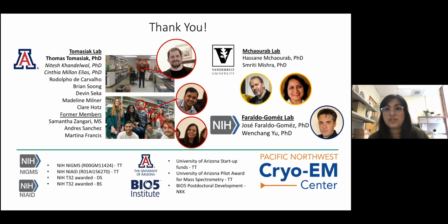In terms of movements from 3D variability or multi-body refinement, we haven't done those yet. So this is on our list. Now that we've sort of caught up with our computational infrastructure, we had a lot of projects in the pipeline and not the most readily accessible computational resources. I am really interested in revisiting some of the data with the new developments in RELION 4, as well as CryoSPARC. So that's a great question.